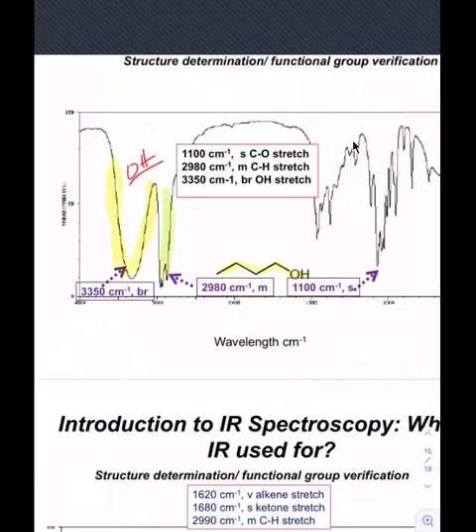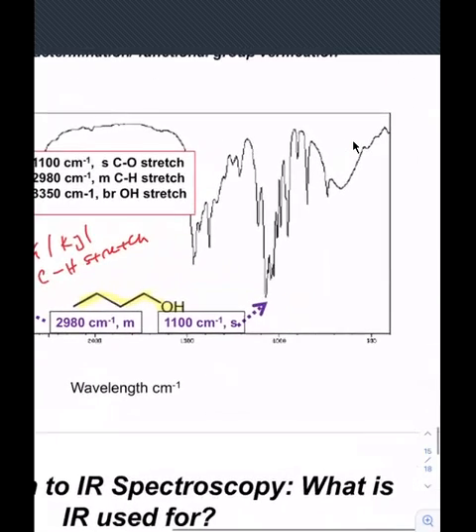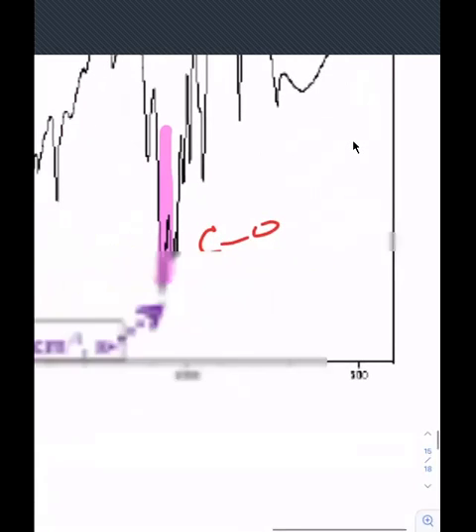That's going to be my alkyl. CH stretch, and then over here, that's going to be my CO sigma bond stretch.